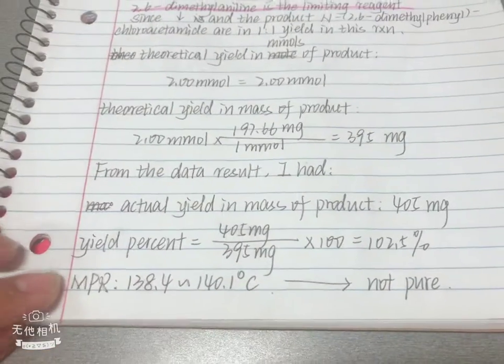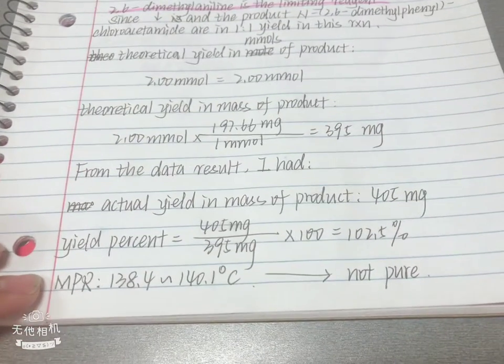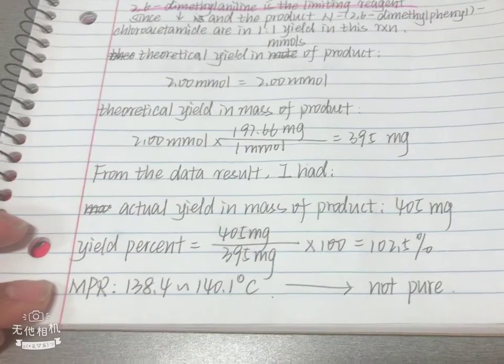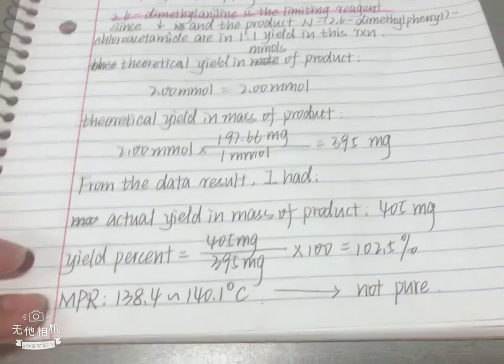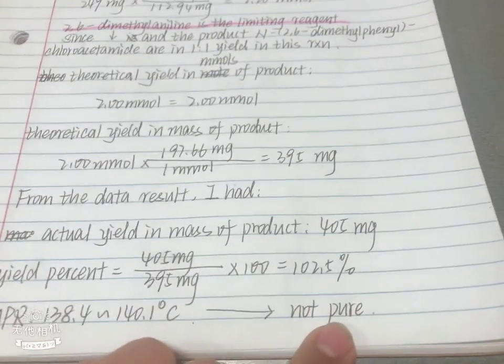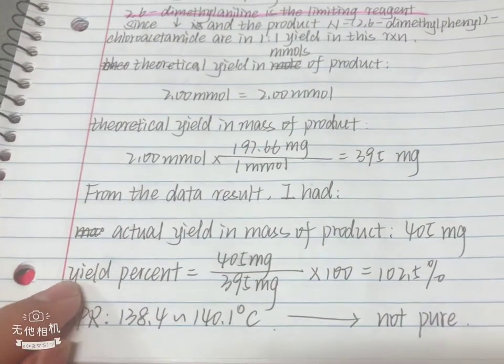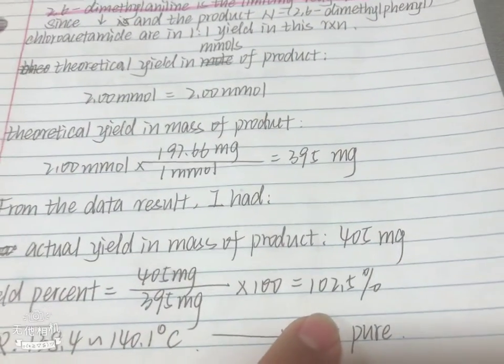But I can explain it because I measured the melting point range between 138.4 to 140.1 degrees centigrade, which is lower than the theoretical melting point range of 150 to 151 degrees centigrade. So we can say it's not pure, because the impurities in it would bring down the melting point range. And here is the percent yield we calculated, and we got 102.5%.